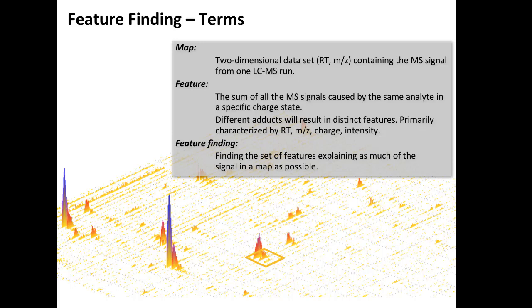What's nice here is you can also see there's some endogenous contaminant that's just continually eluting right there. Well, it's big enough you can use it as your calibration. Yeah, you can. I mean, there are many purposes, but for most purposes, it's just a nuisance. Also for algorithms.